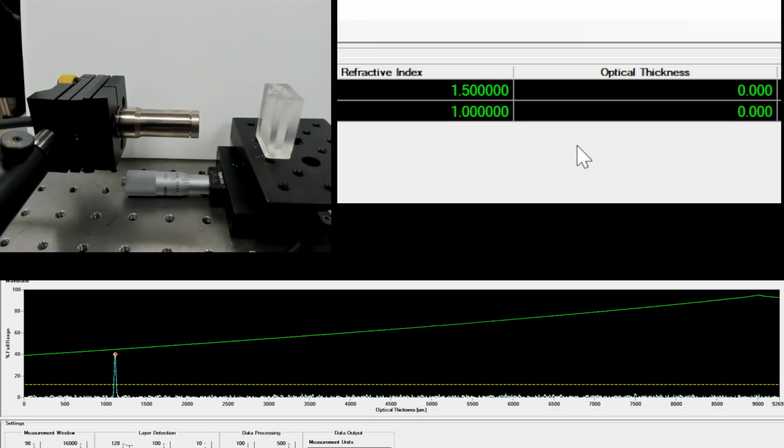So as the cloudy water settles, we lose the back signal for a little bit until we get a good mix, and the saline isn't as cloudy. I'm going to see if I can stir things up and help that along. I may have gone a little overboard with the salt on this one. I might not be able to dissolve it all. We'll have to be a little more careful next time.